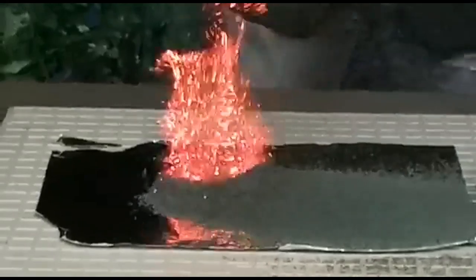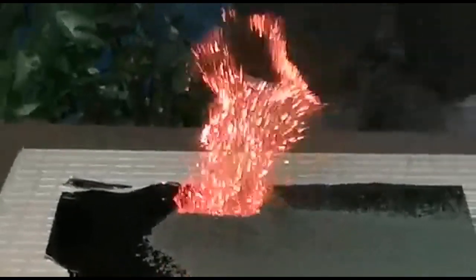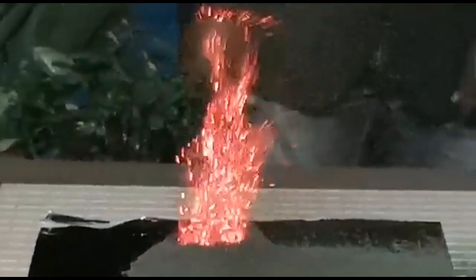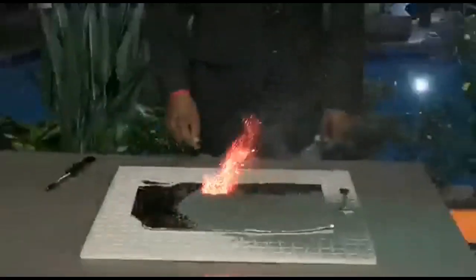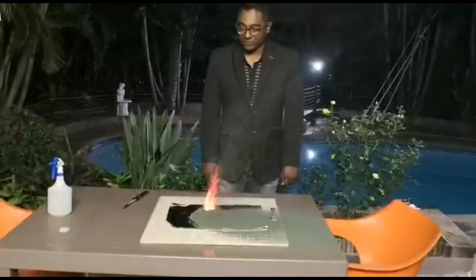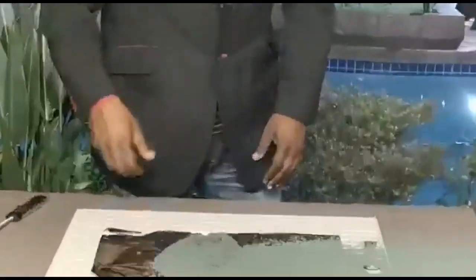That green color is due to the chromium 3 ions being produced, together with nitrogen gas and steam. If that tile was not there, that's going to burn right through this plastic table — so thank God we actually put the tile there in place. There's a lot of ash falling around, so make sure you don't breathe that in as well.